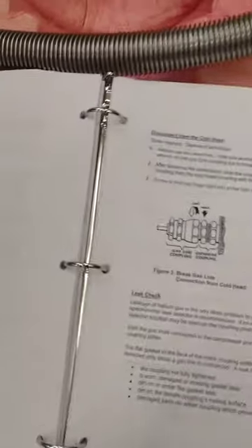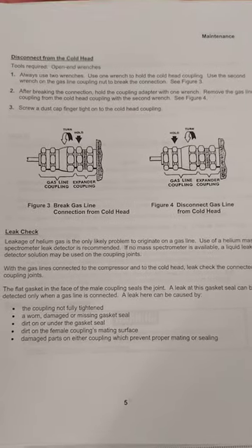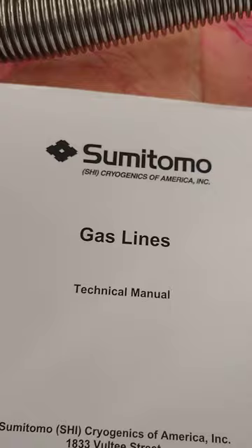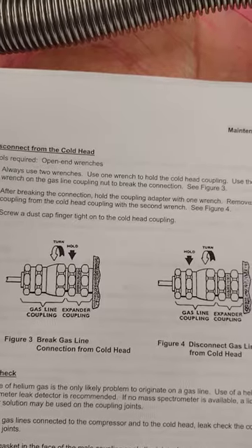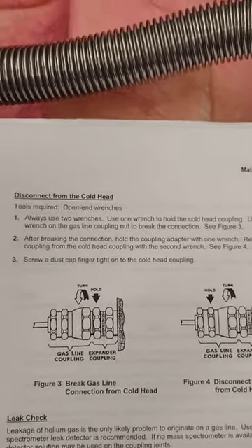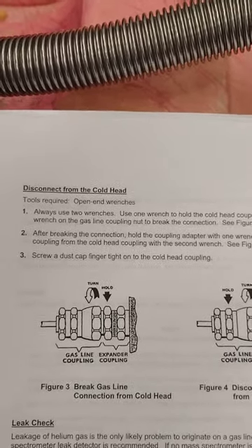Hi Peter. The first thing we'll talk about is disconnecting the gas lines from the cold head. You might have the instruction manual from Cold Edge — in the section titled 'Gas Lines' on page 5, you'll see a diagram that indicates the order in which you need to loosen connections in order to disconnect the gas lines from the cold head.